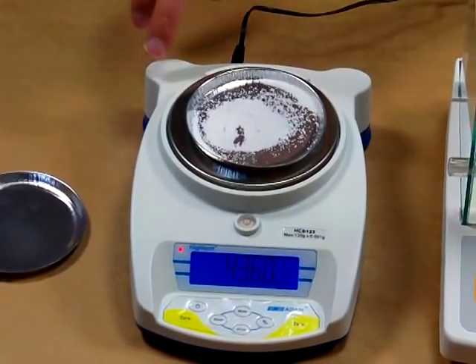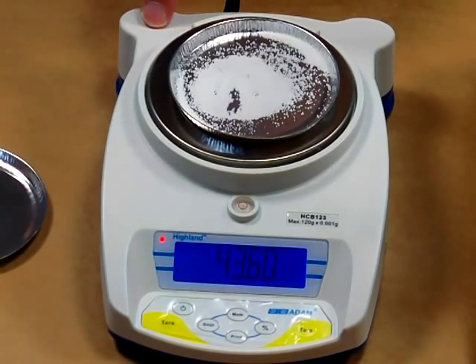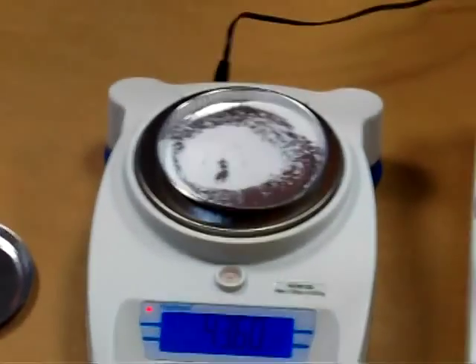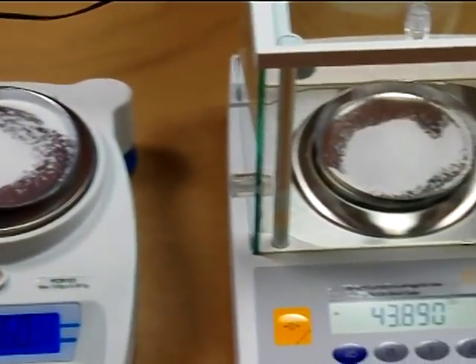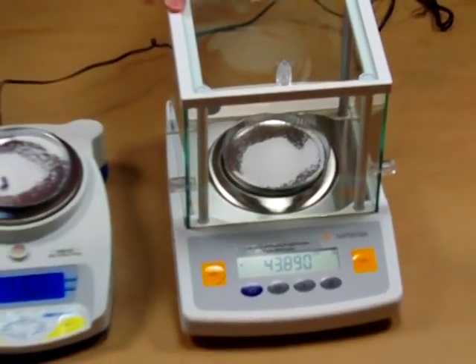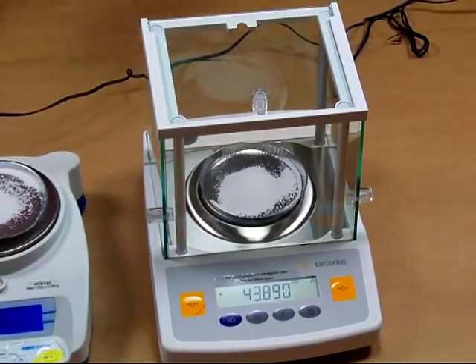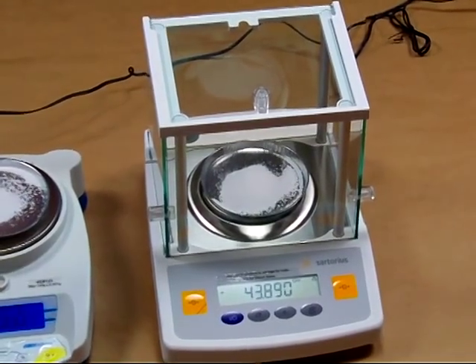The manufacturer states that the capacity is 120 grams and the readability is to one milligram. Next to it we have the Sartorius GD503. This balance is 100 grams by a tenth of a milligram. For this demonstration we have both balances set up in the grains mode.